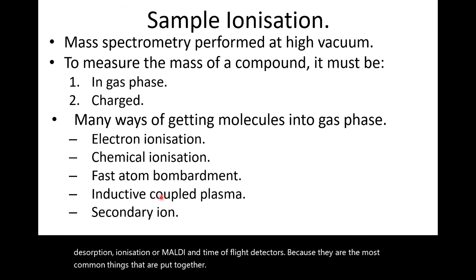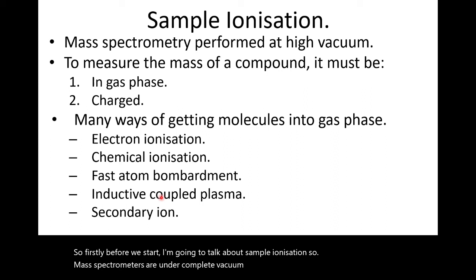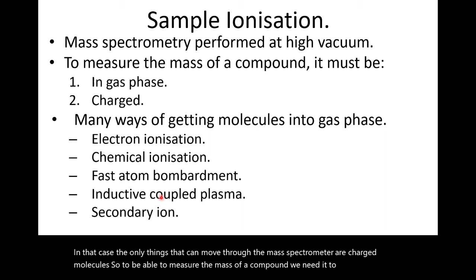So firstly, before we start, I'm going to talk about sample ionization. Mass spectrometers are under complete vacuum inside them so that we don't measure the molecules that we don't want to measure. So anything that is inside the mass spectrometer gets sucked out by the vacuum system. In that case, the only things that can move through the mass spectrometer are charged molecules. So to be able to measure the mass of a compound, we need it to be in the gas phase and we need it to be charged.